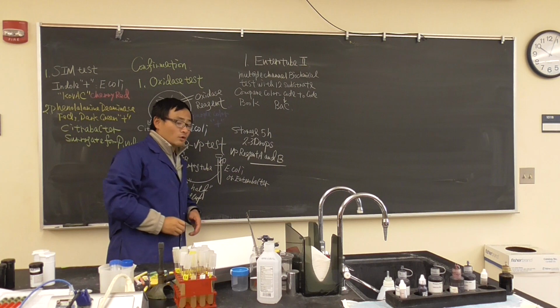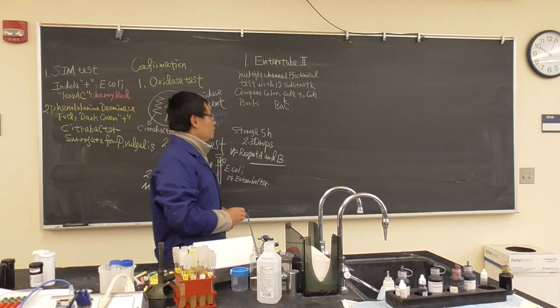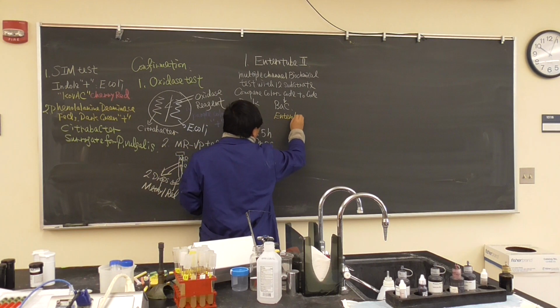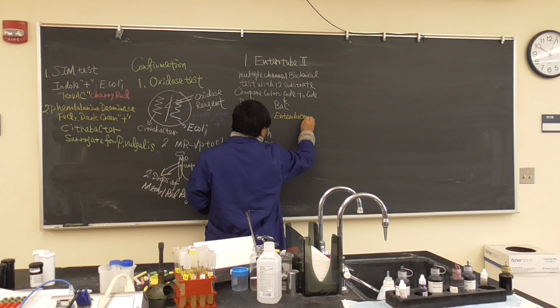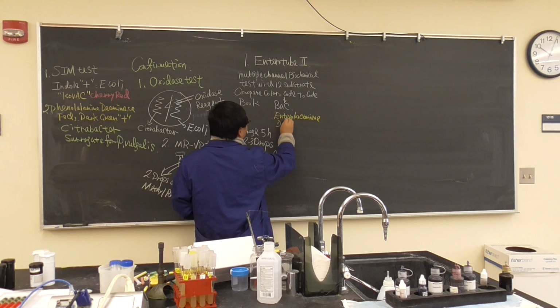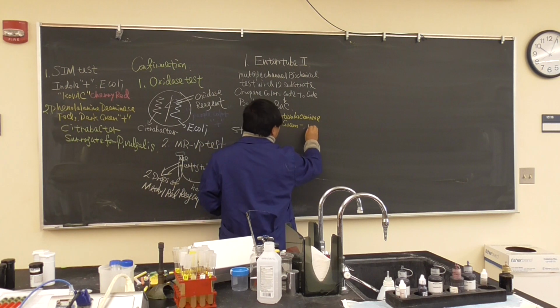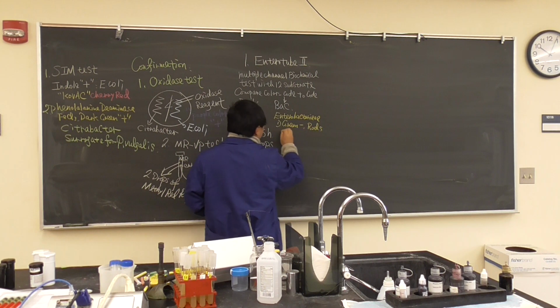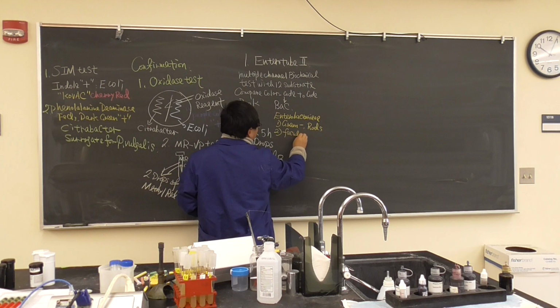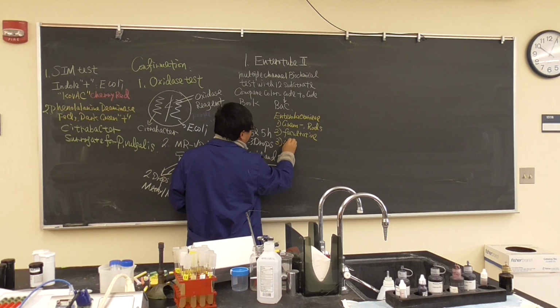Okay, now why can we do that? Because most of these tested bacteria belong to a group called Enterobacteriaceae. They all have very similar characteristics: gram-negative, rod, and facultative, non-endospore forming.